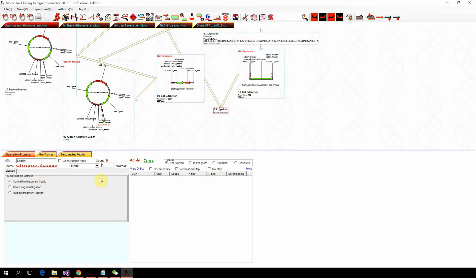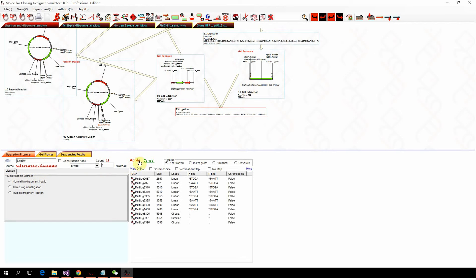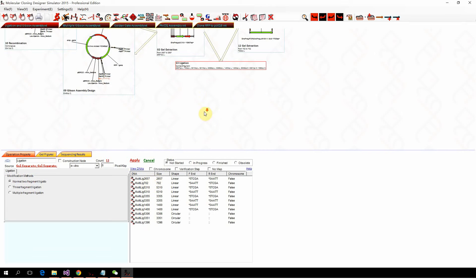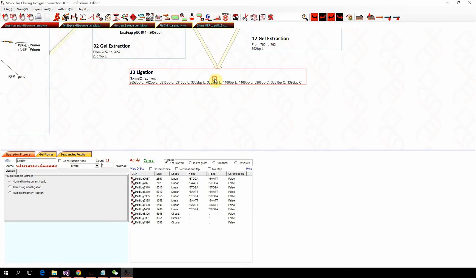We click apply, but you can see we got a range of different products because the software actually simulated the real ligation process. You actually got all the intermediates in the ligation products and also the byproducts.